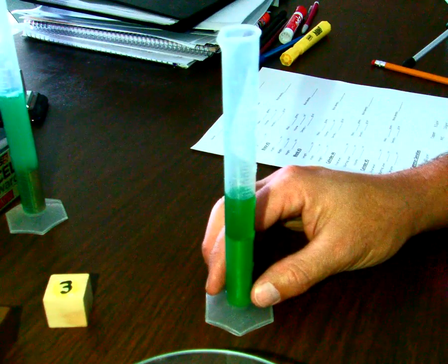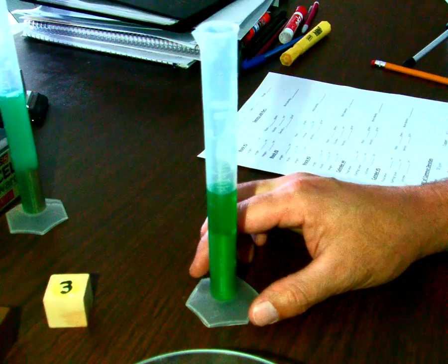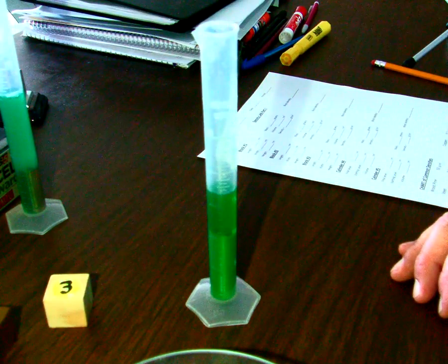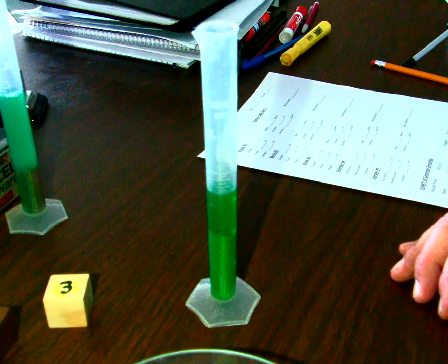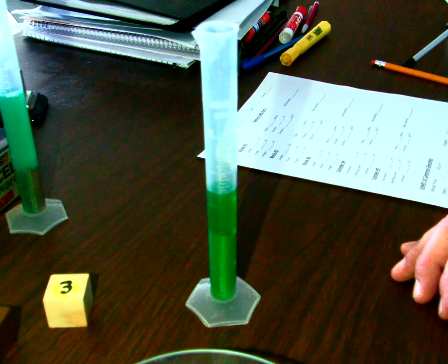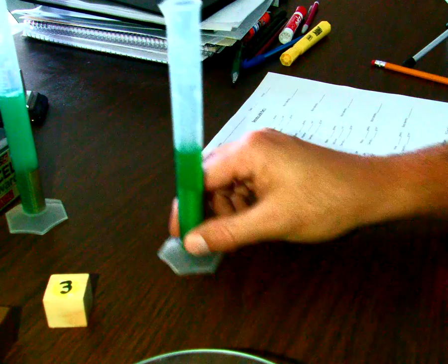And it looks like our new height is going to be 16.5. So 16.5 is our final level. We started at 10 milliliters and our final level is 16.5. So if you would, go ahead and record that data into your lab sheet.